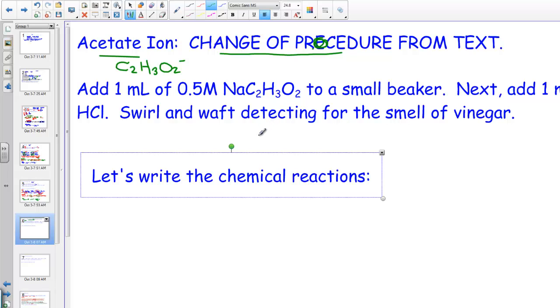We're going to add 0.5 molar — 1 mL, which is 5 to 7 drops — into a test tube of sodium acetate. This is the ion that we're checking for. It can be in a small beaker or a test tube. Next, we're going to add a mL of 6 molar HCl and swirl that.